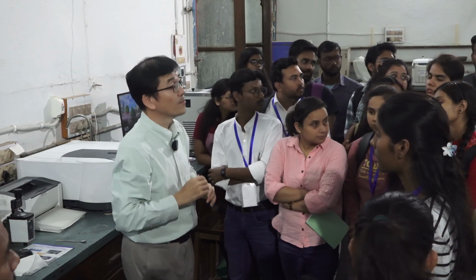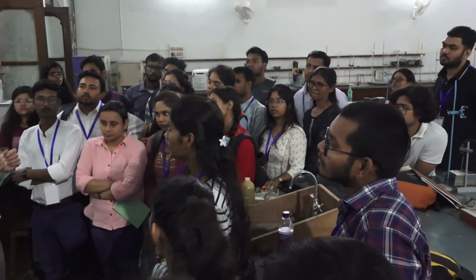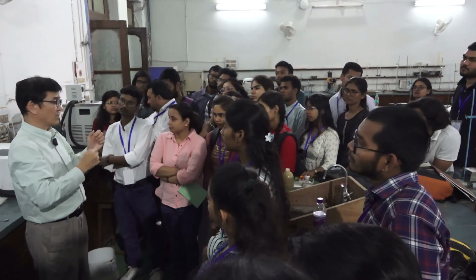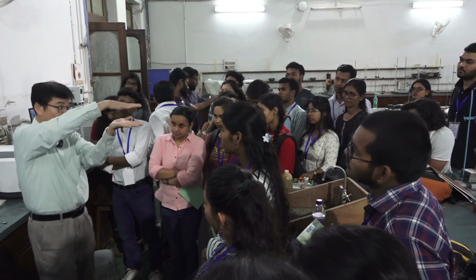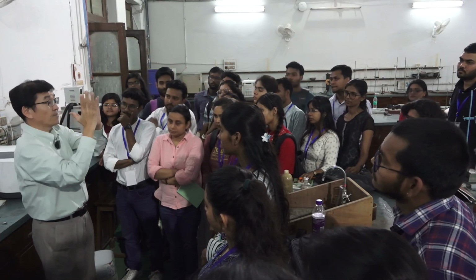Can you repeat the difficulty of the transmission configuration? Okay. In the transmission configuration, we put one drop on the window and put another window, then set it in the spectrometer.